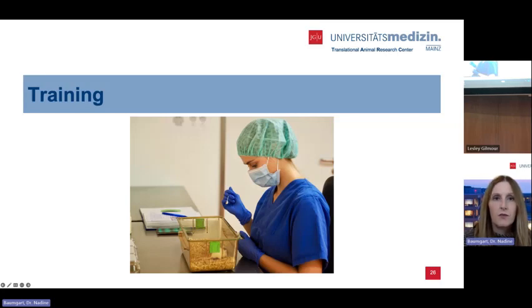We have a clicker. We have a lab book for keeping records, which is very important because sometimes something happens. So your phone is ringing, you have an urgent call, or someone is coming in, or some building or construction is taking place. Make sure you note this in your lab book, because otherwise you might ask, oh, what happened to my animals? Why are they not behaving like always? And so it's important to keep records like always in the lab. And we also have a timer.